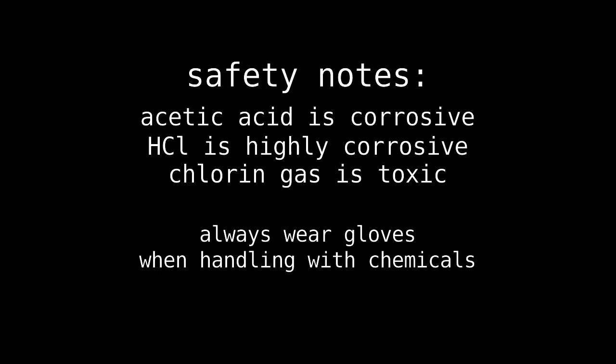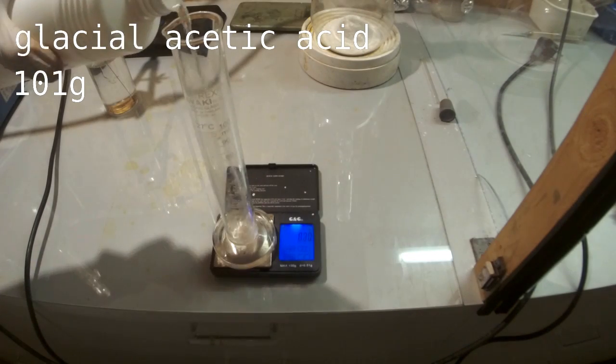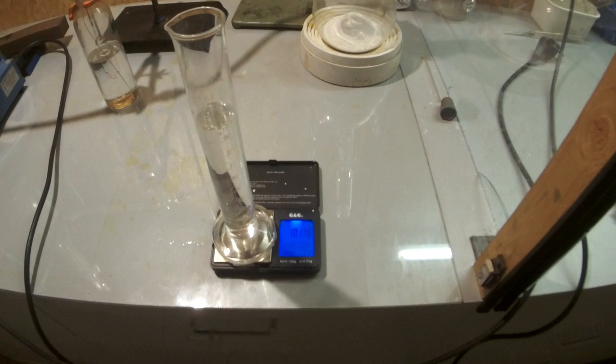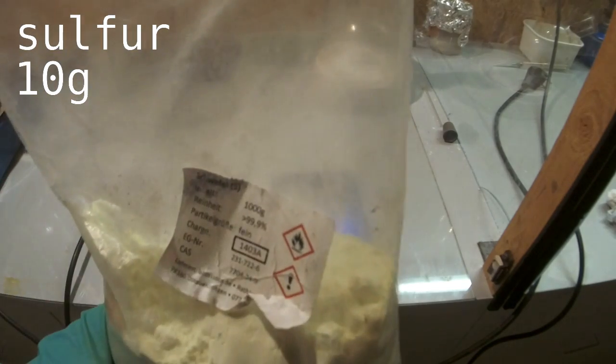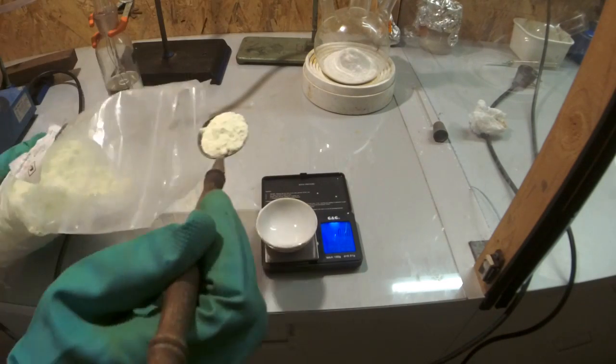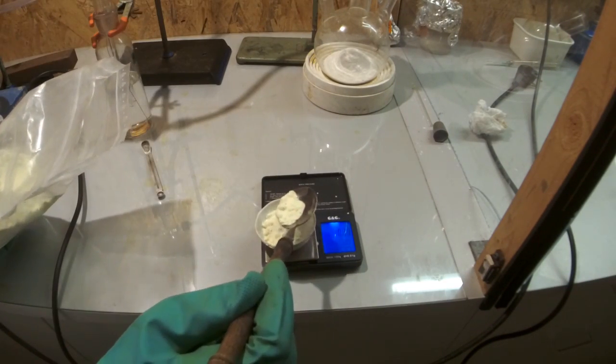For this purpose, I weighed out 101 grams glacial acetic acid and 10 grams sulfur as a catalyst. For the chlorine gas generator, I used TCCA, which was obtained from pool tablets.